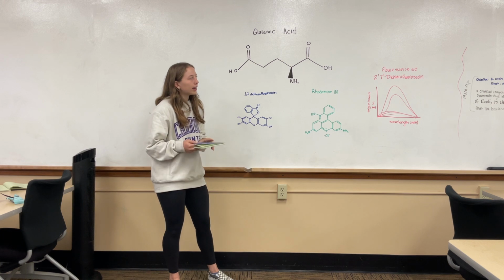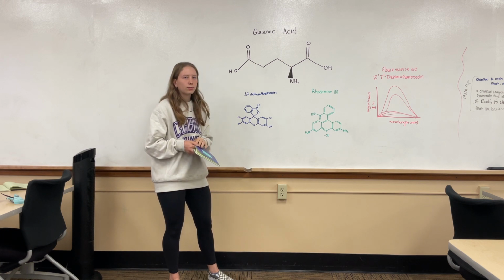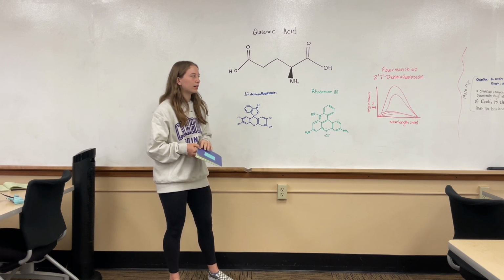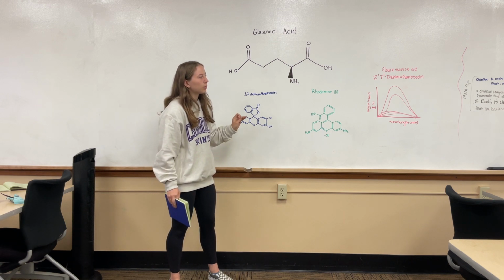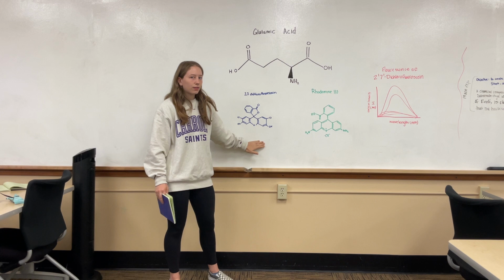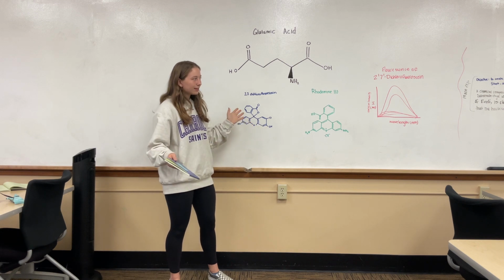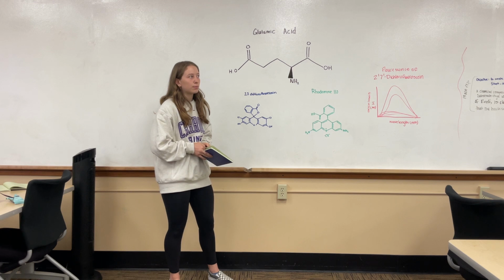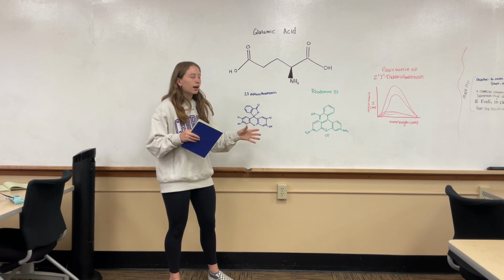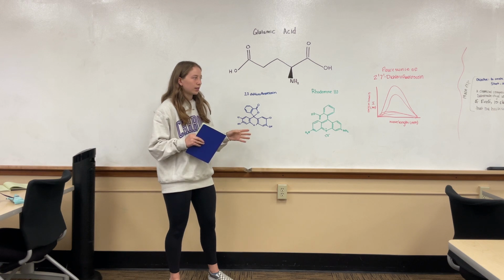But what we found in creating our stock solutions was that that procedure isn't necessarily streamlinable, because rhodamine 110 wouldn't fully dissolve even in 1,000 milliliters, and 2,7-dichlorofluorescein was going to be way more dilute at 500. So we ended up trying to find a good absorbance that would register in the UV-vis at about half.